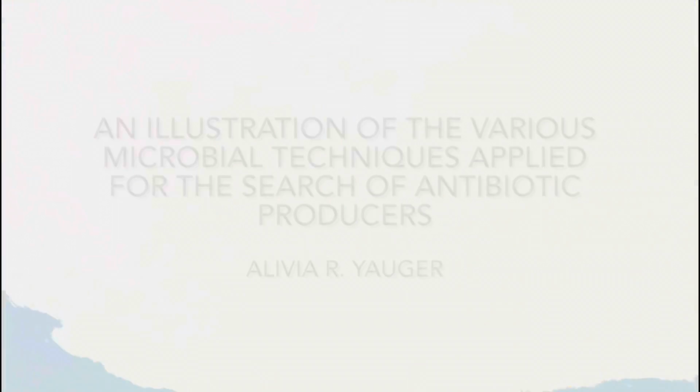During this semester, I had the privilege to study microbiology. Throughout our lab periods, we used the Tiny Earth program. The Tiny Earth program allows students to search for new antibiotics in the soil. The following presentation is an illustration of the various lab techniques used throughout the antibiotic search. Although my results lacked antibiotic producers, the techniques and protocols furthered my education and can be used by others to potentially find antibiotic producers of their own.